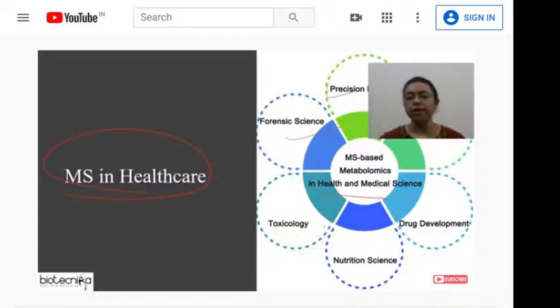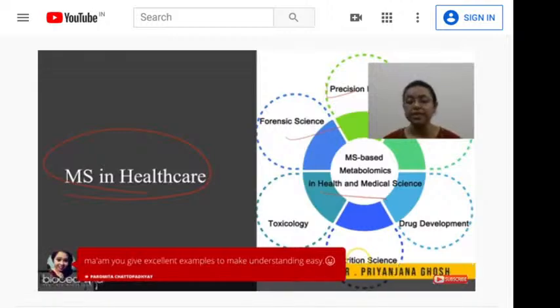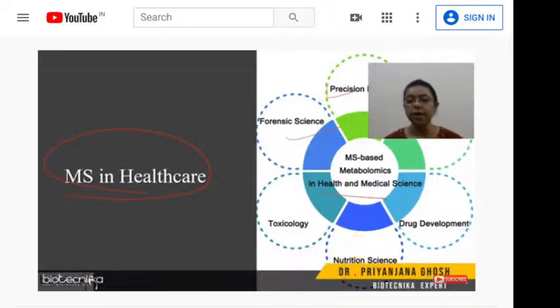Mass spectrometry has gained a lot of popularity for protein analysis, and it is highly in demand specifically in the healthcare sector, due to its ability to tackle the intricacies underlying the proteome. And the most important thing is the three fundamental applications of the technique in proteomics, which is based on mass spectrometry.